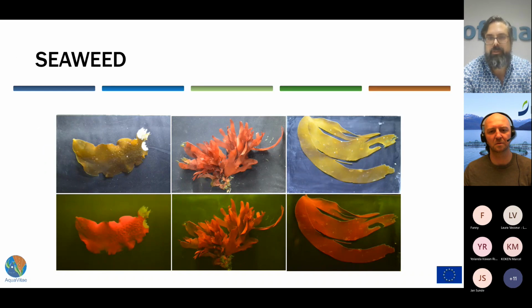Seaweed, we looked at 5 different species. On the top here in regular light, you can see the Saccharina, middle is the Palmaria, and the right is digitata. And under the excitation below, it's not a surprise, as chlorophyll is known for quite a while to be biofluorescent. But what is interesting here is that in the Palmaria in the center and in the digitata on the right, the animals, or excuse me, the macroalgae, is producing some type of yellow exudate. What it is, I'm not certain, but it's something that the seaweed specialist here, Xinjin Wang, has not seen before either.